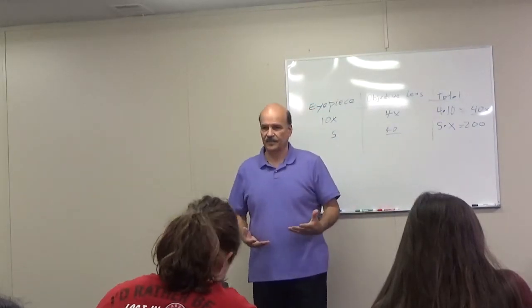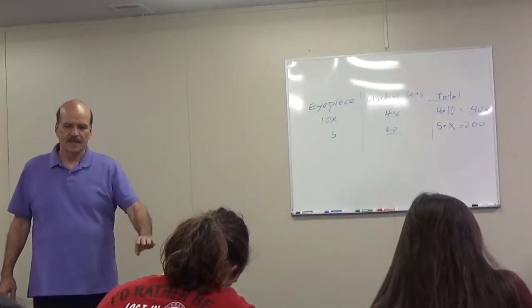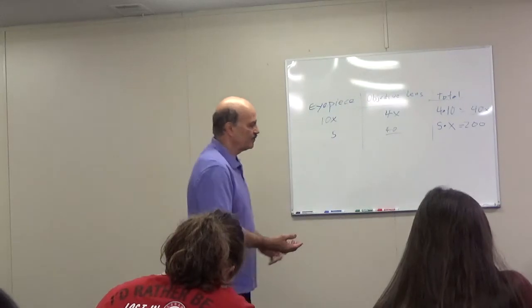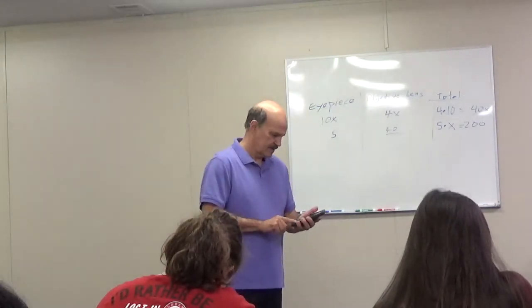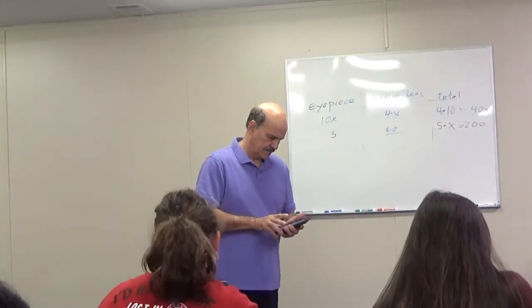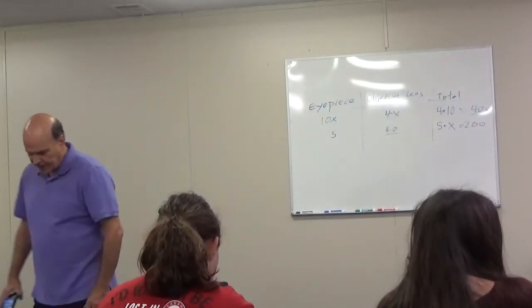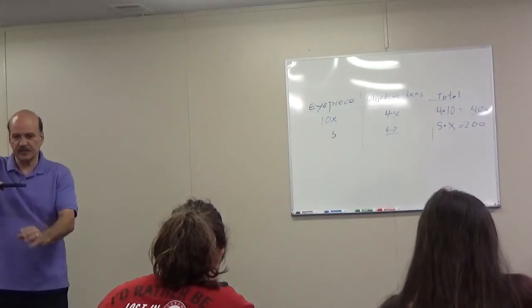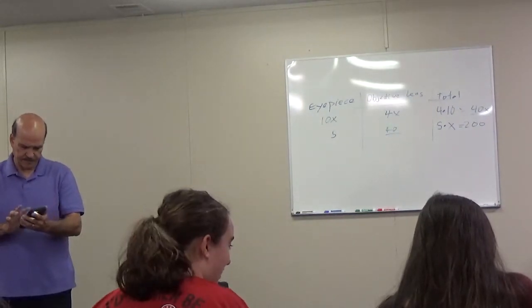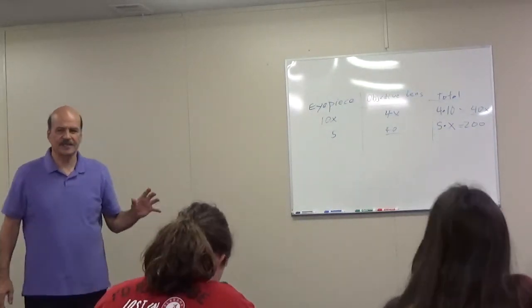You need more light. Now the other thing is, I turned in a microscope that had a problem with the light not working. And what you were telling me to do is, if you take the LED light on your phone and you stick it under the lens, it should actually light up your microscope really well. So, guys, here's your platform, and here's the lens, but it's not working right. If you just stick this underneath it, it'll light it up. We've all used it for flashlights before. So if you have that microscope, that's what you'll do.